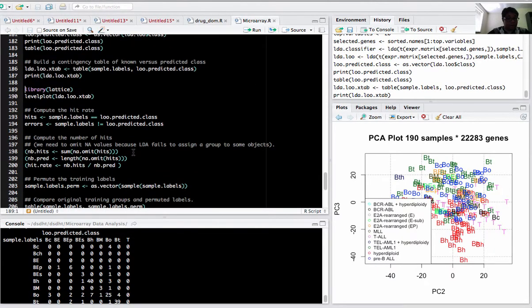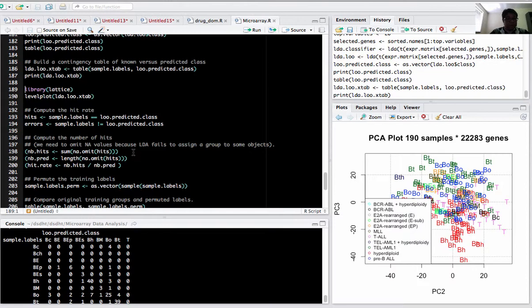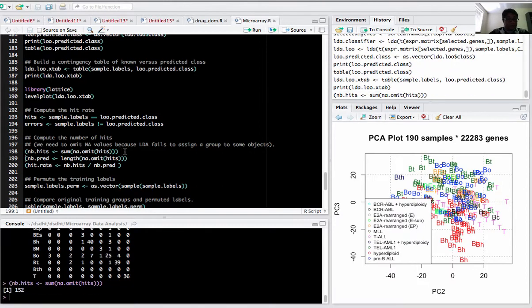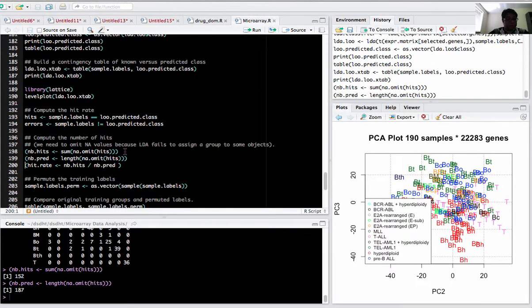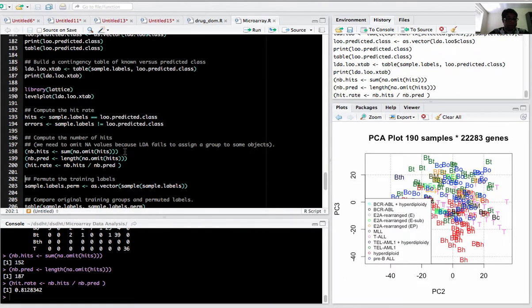Sometimes LDA computes some values as NA. We need to compute the number of hits and number of predicted results and the hit rate, so we need to omit the NAs. I sum the results - it comes around 152 rather than 190, so the remaining were given a value of NA. Number of predictions is 147, so hit rate is number of hits over number of predictions, like 0.81.